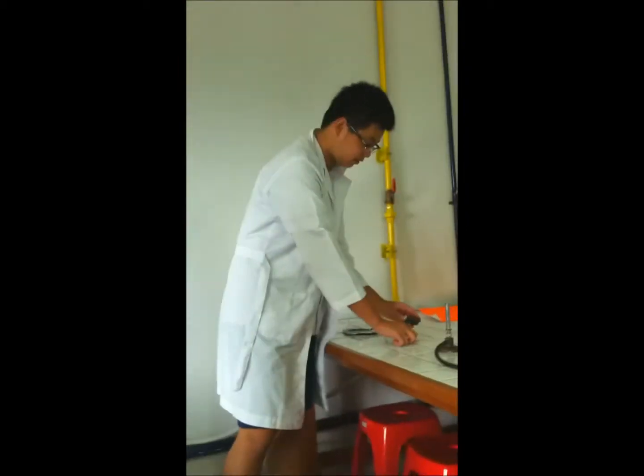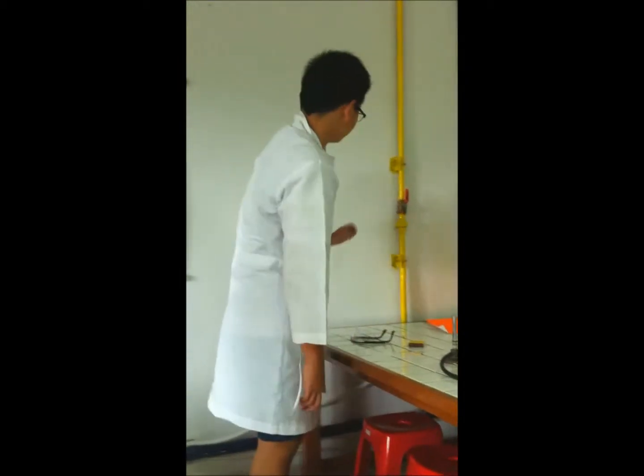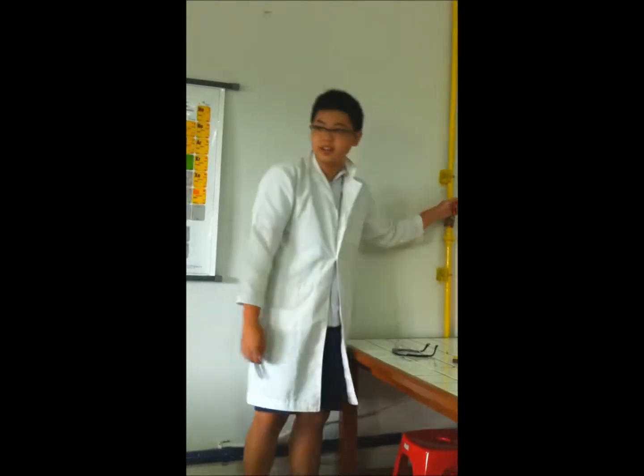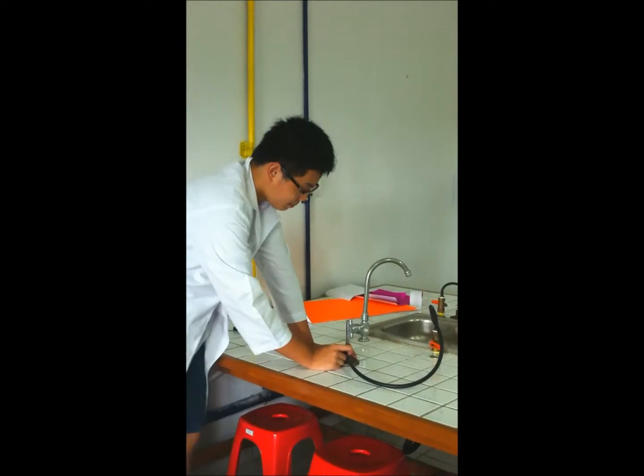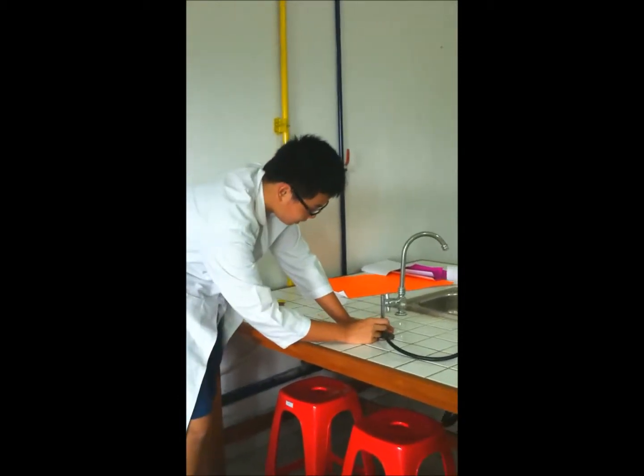How to use a Bunsen burner safely? The first step is to turn on the gas. The second step is closing the hole on the Bunsen burner.